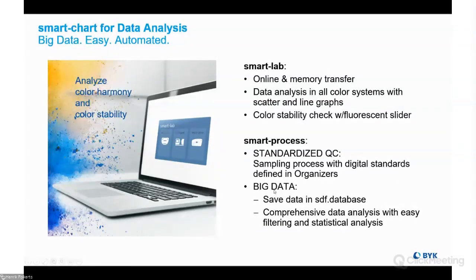At the end, you collect everything in one database. This is also called big data. For example, if you have to measure, or you are producing in the next 3 years 150,000 whatever refrigerators, and you want to control and monitor that, then it's nice to have an organizer.